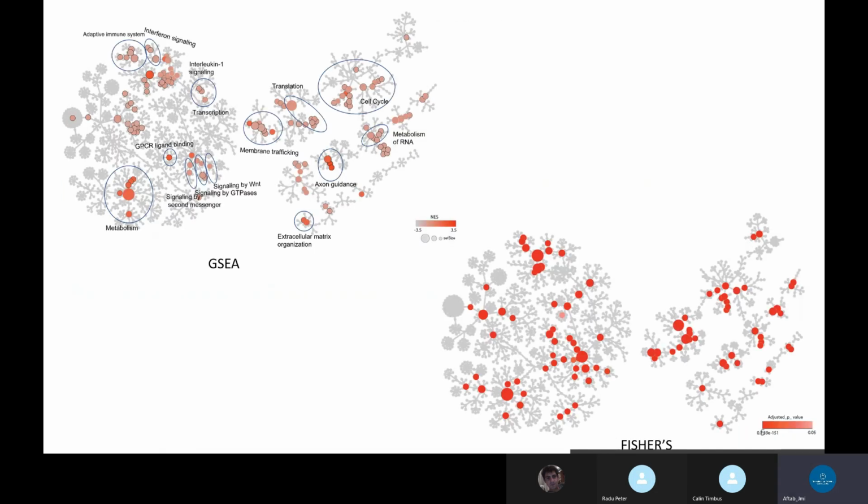Here visualization is very important. In our process, most of the enrichment is depicted by this figure. I will explain how this figure can be downloaded. Suppose color is just like an enrichment score. Enrichment score here is positive and negative, meaning positive score represents the top and bottom of the list from the ranking, and ball size defines the number of proteins involved in that particular set of genes. All the balls represent only one pathway. So here approximately 2600 pathways now exist. We have to explain that in the next slide.